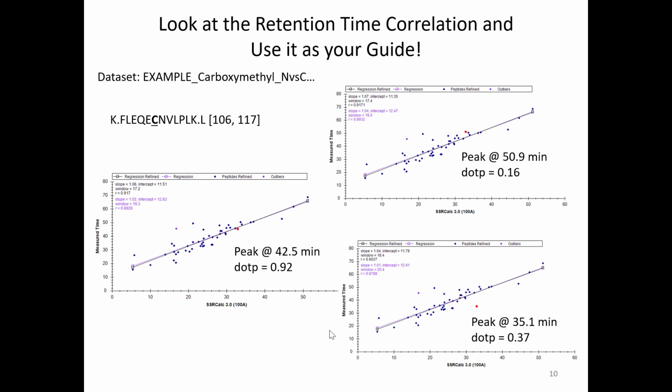If you have an indexed retention time, will the peak picking of Skyline be influenced by that? Usually, if you use indexed retention time to help predict the retention time in the method and you schedule it, Skyline has fewer options. Skyline picks peaks by tallying up scores. We'll talk about this tomorrow. But it just takes a tally of whichever peak has the highest score, and that's the winner it picks. And retention time is one of those scores.